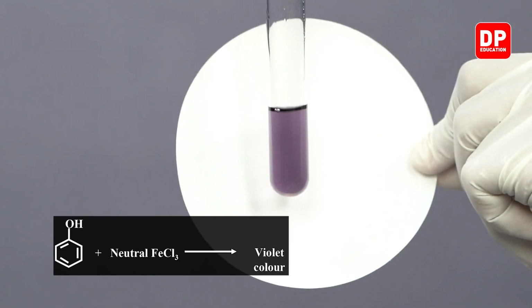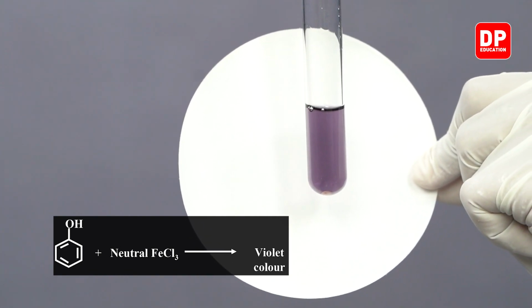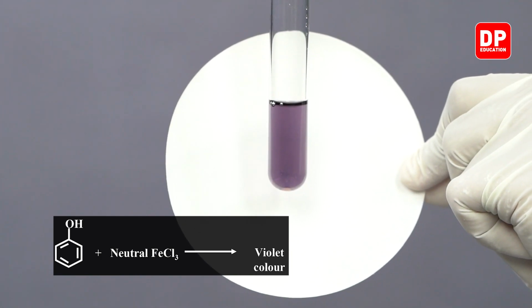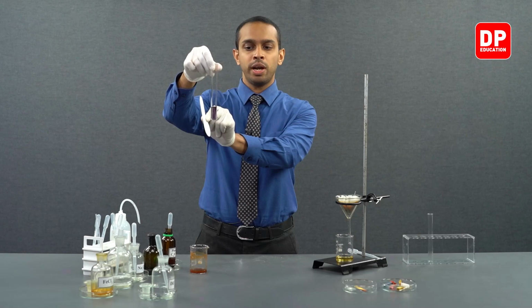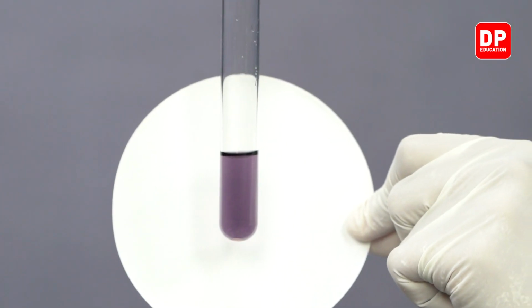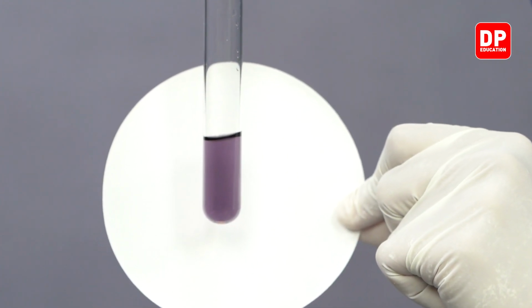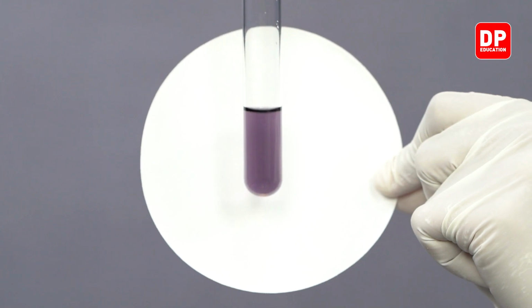As you can see, a violet color solution was formed. Normally you saw phenol was not dissolving very well with water, but you can see here all of the phenol that we added dissolved really well and produced a violet color solution.